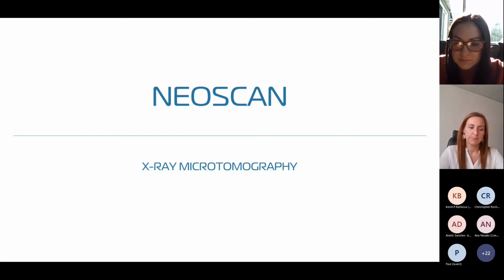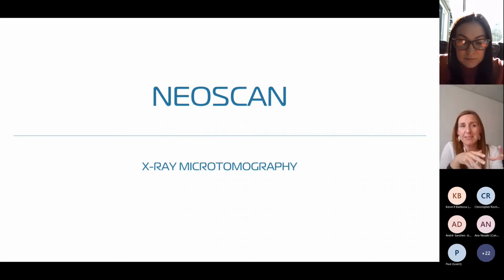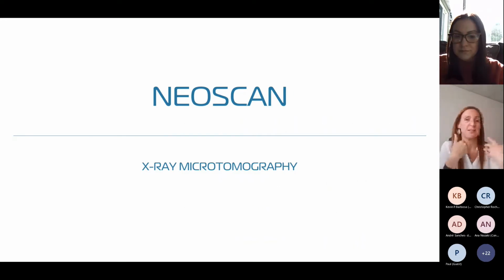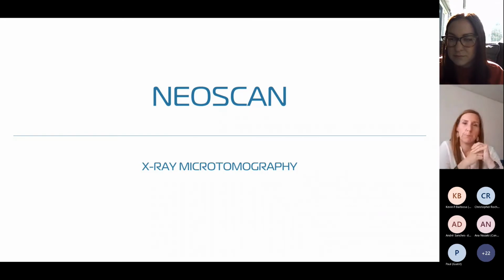In the past 2 years, I scanned a wide variety of worms, insects, zebrafish, whatever you can think of. I only made a small selection. The nice thing about MicroCT is that it's widely applicable to a wide variety of samples. That's also what makes my job very interesting, because I get to work with biological samples one day, food samples the next, and in 2 weeks I'll be talking about geology. So it keeps my life fun as well.